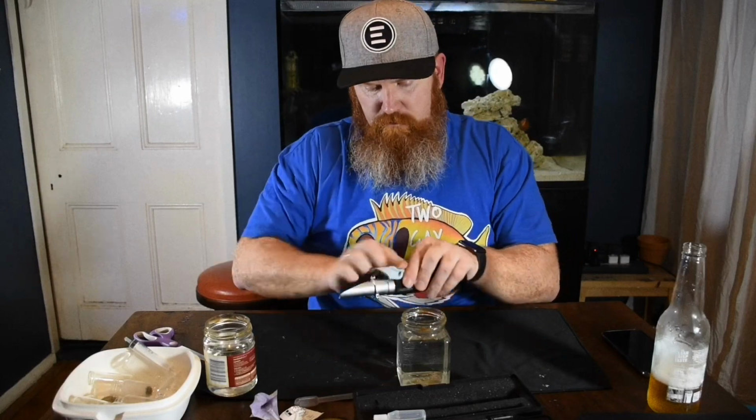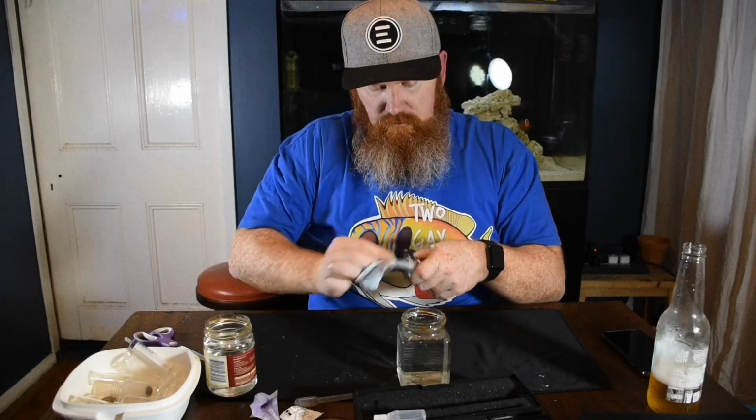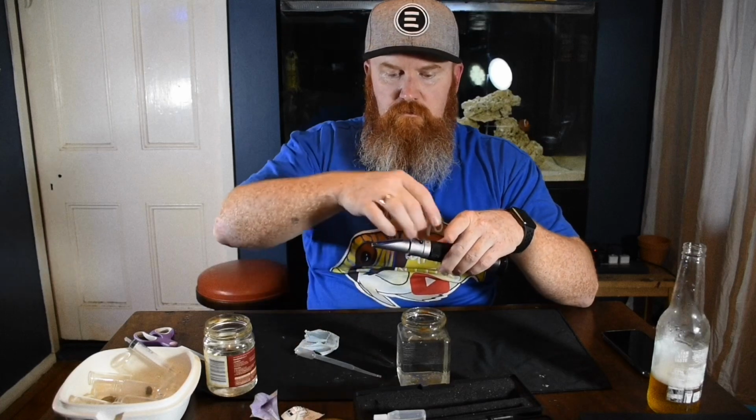Grab out the refractometer. Grab yourself some RO water, and you want to give it a clean. Just always worth giving it a clean, just in case you left some salt water on it last time, which I know I didn't, but always worth doing. Then you want to grab a couple of drops of RO. Every single time I use it, I check that it's still reading correctly. All right, so that is reading at absolute zero. So we know that it doesn't need to be recalibrated at all.